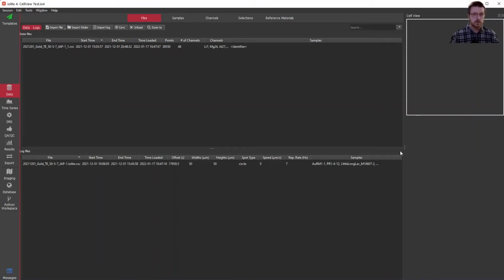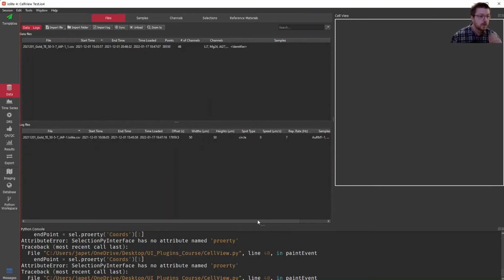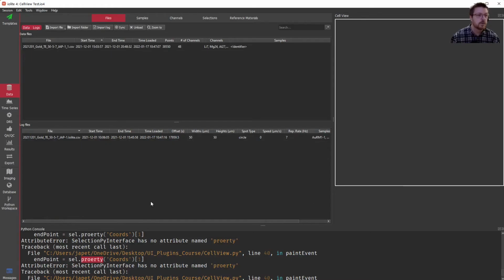Okay, so I have a typo here, right? I've misspelled property. So let's go back. Yeah, property. Let's see if that fixes it.